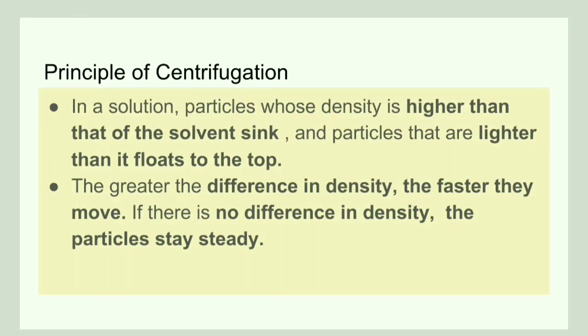Next, we will discuss the principle of centrifugation. The principle is that particles which have higher density than the solvent sink, while particles which have lighter density float at the top.